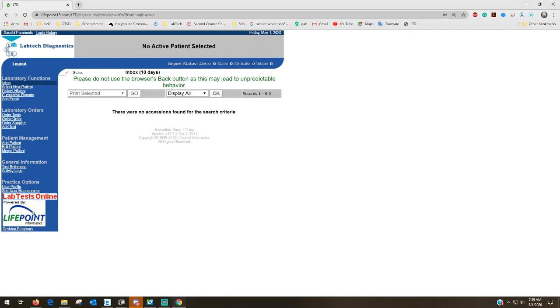Once you get this up, it'll always start in your inbox. This will show you the last 10 days worth of reports that you've gotten in, results. From here, as you can see, it's not showing anything. If and when y'all start, what you'll have to do is select new patient. And I tell everybody, always do the select new patient first because all it is a search, and it will allow you to know if you already have a patient added to the database that comes with this.